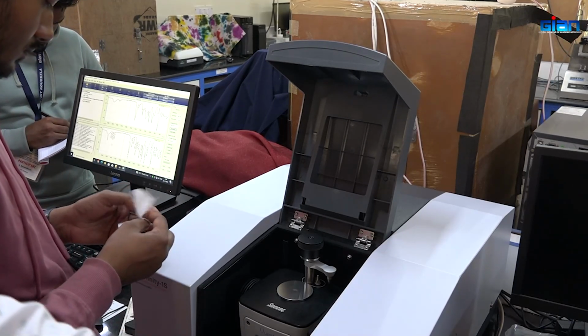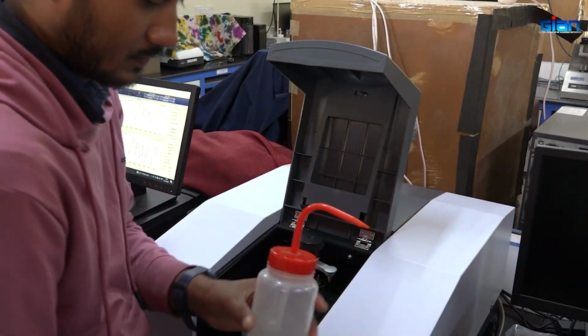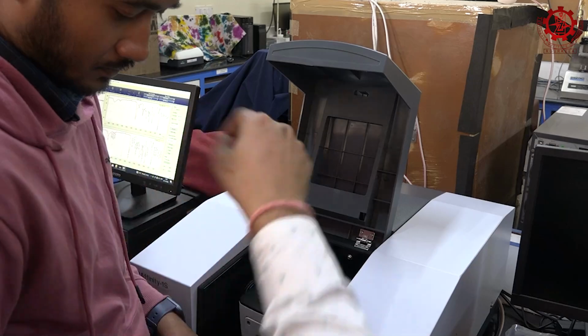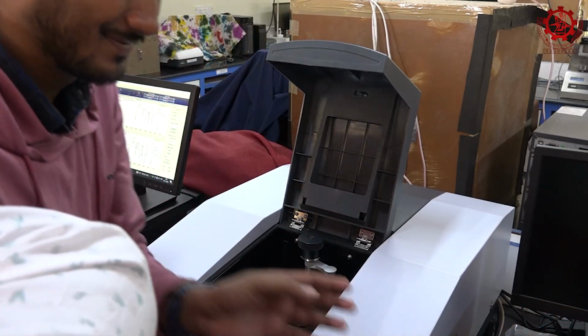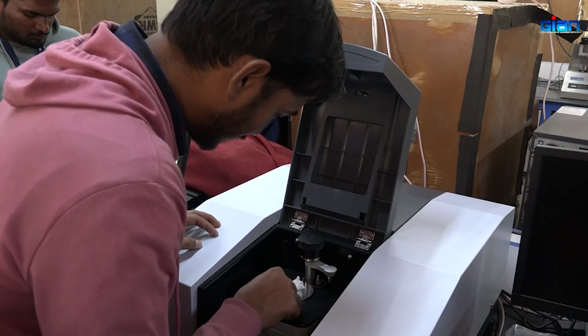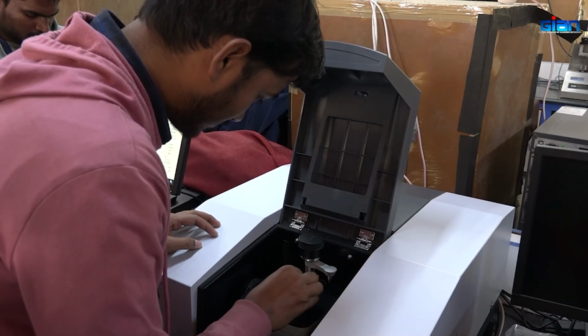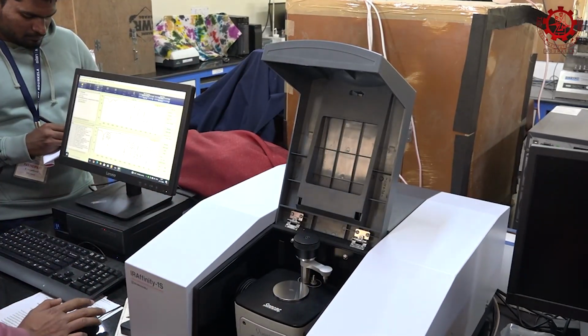Because you are taking a lump of solid, when you put it, it may not be uniform. So, now we have this one, so we press down. When you press down, hopefully that will make a uniform film of that solid compound. So, that is what we will be trying. Now, let us see.